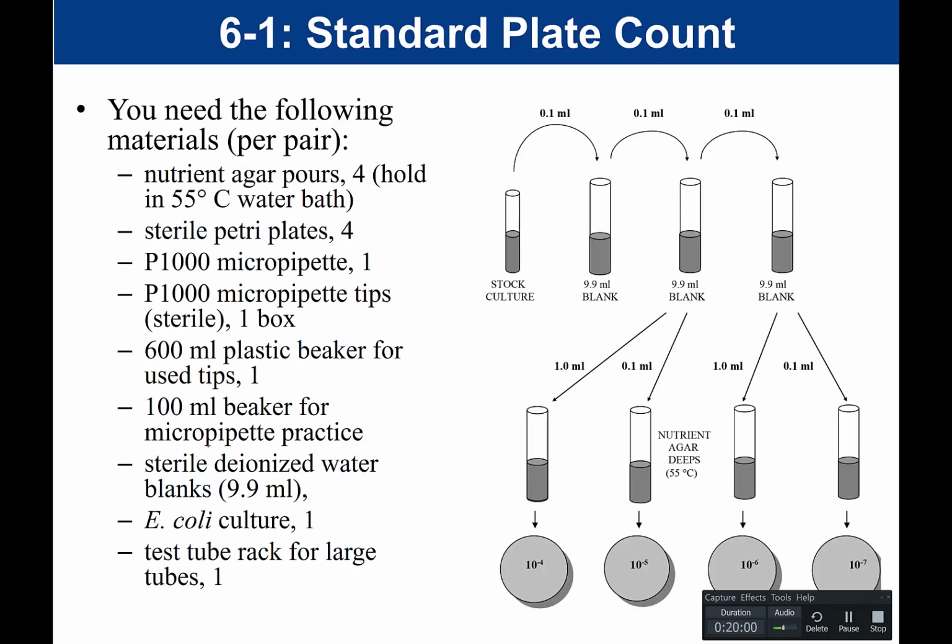So when we do our standard plate count, we would have you get the following items per pair. So we have our 4 nutrient agar deeps. Notice it says hold in a 55-degree water bath. So we don't want to take these agar deeps out of the 55-degree water bath until we're ready to go. If we take them out at the beginning of the experiment and we set them on our desk, that is going to be problematic because by the time we're ready to use them, they would solidify in the tube.